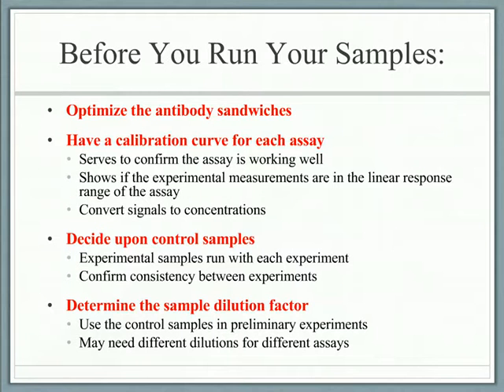And the way that we set the dilution factor is we take the control samples and we run them in preliminary experiments under several different dilutions and see how the signals match up to the calibration curve. And I'm going to show you an example of that. And as I mentioned, you may need different dilutions for different assays, depending on how concentrated the starting concentration of the analyte is.